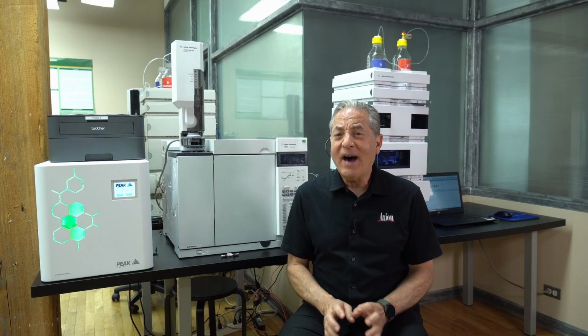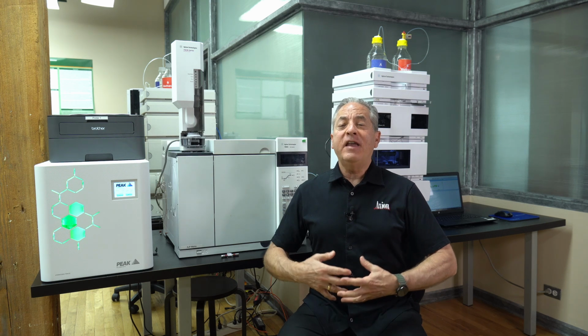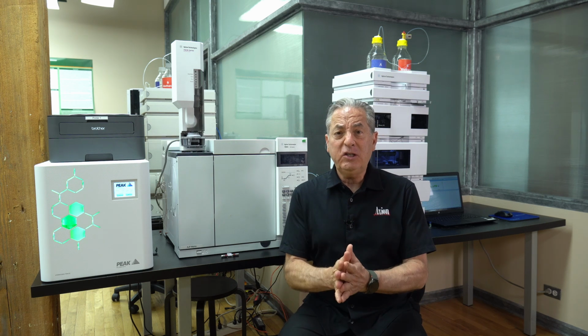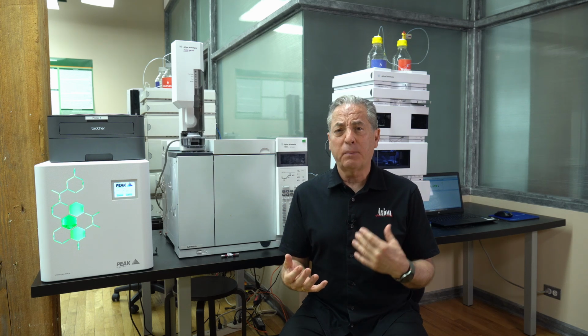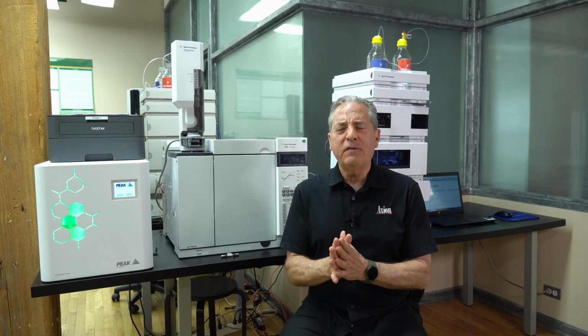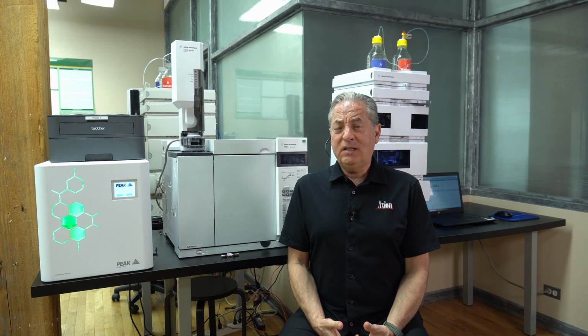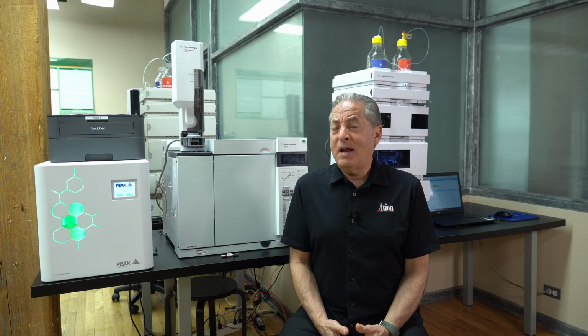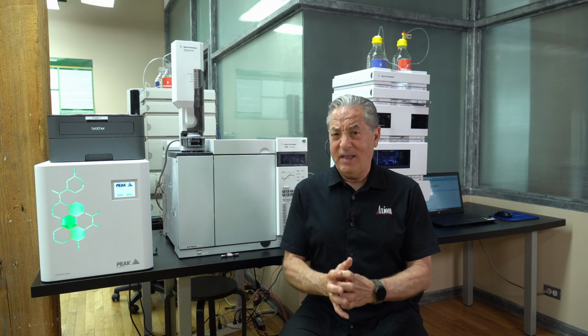But now let's talk about how that separation occurs. In both LC and GC, we have an affinity for the stationary phase. So in the GC world, we have a stationary phase and a mobile phase. Mobile phase is a gas, we're passing through the column. And the stationary phase is a place for the analytes to spend time. So in GC, the separation is based on mostly the boiling point of the analyte and how much it likes the stationary phase. That's it.